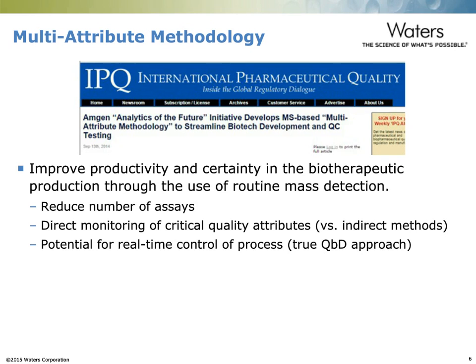And this has really enabled them to reduce the number of assays that would be required in terms of assessing the critical quality attributes, by being able to directly monitor each of those attributes in a single method, and then offers the potential for real-time analysis and the opportunity to implement a real, true QbD approach, particularly for process development.